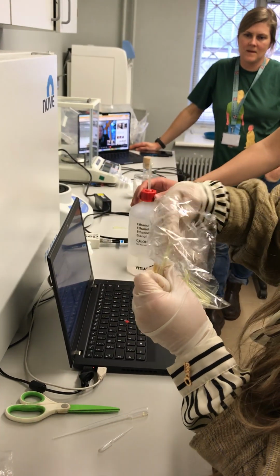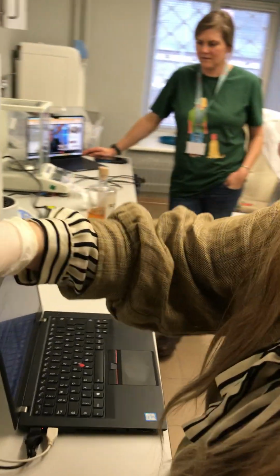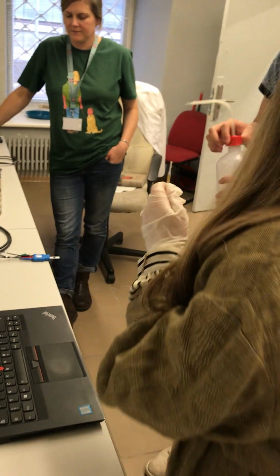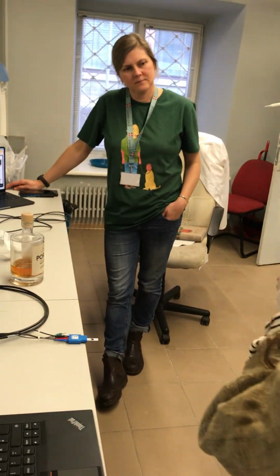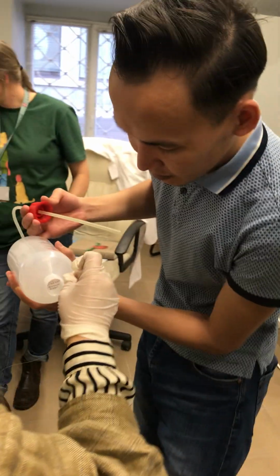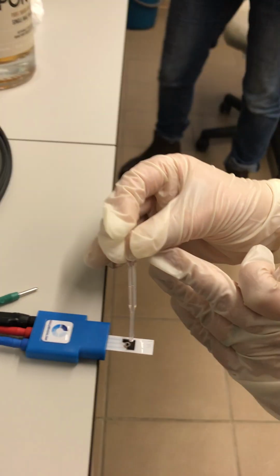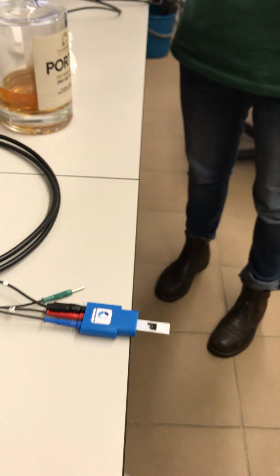Maybe you can help me. You need to open it. Do the same way we did before. Did you get it? Yeah, it's right here. Perfect. Ethanol wash, rinse.